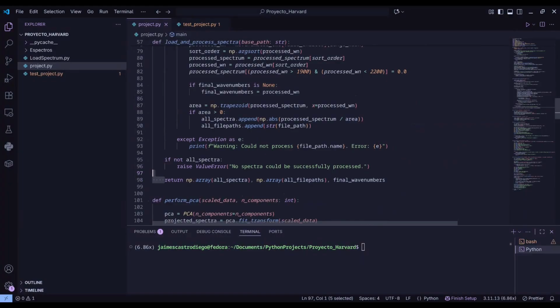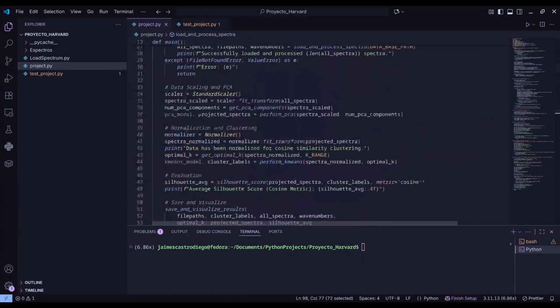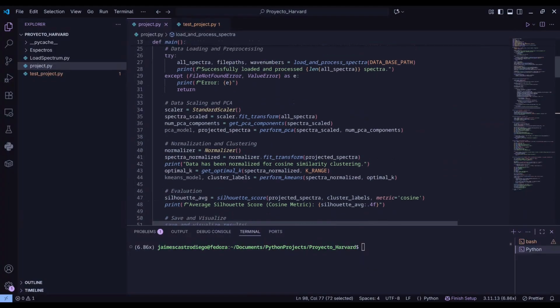That happens exactly here. And that script would analyze this array, the data submitted, by preparing it and simplifying it. And finally, after that, using the k-means algorithm to find the natural groups.